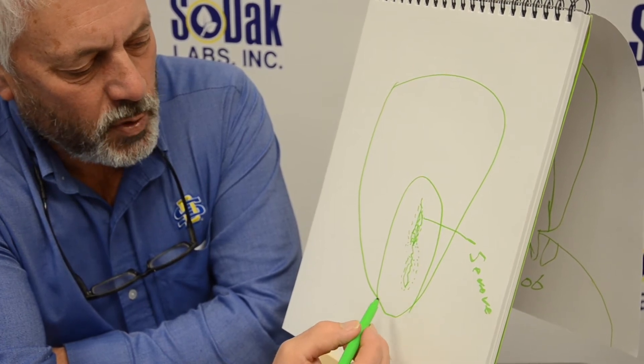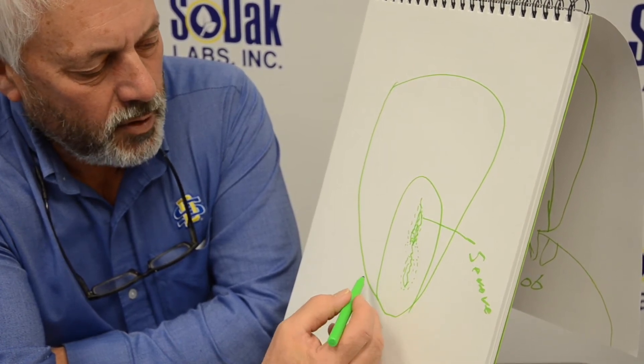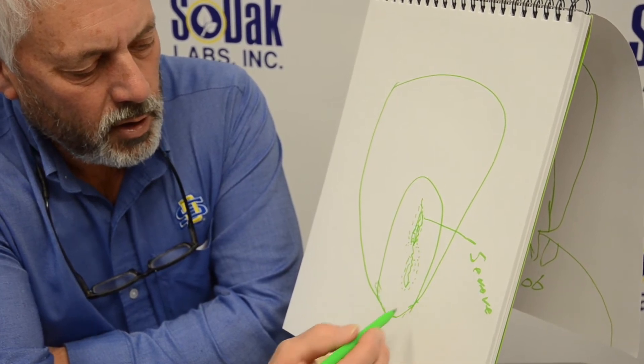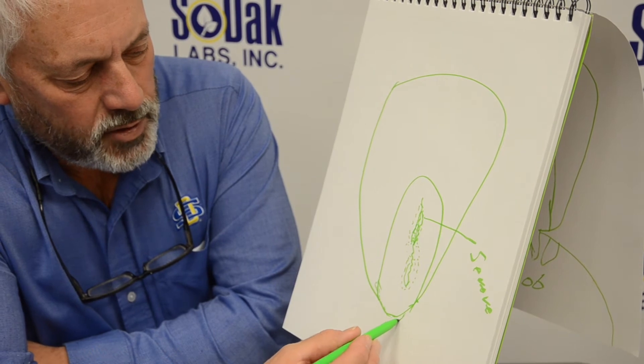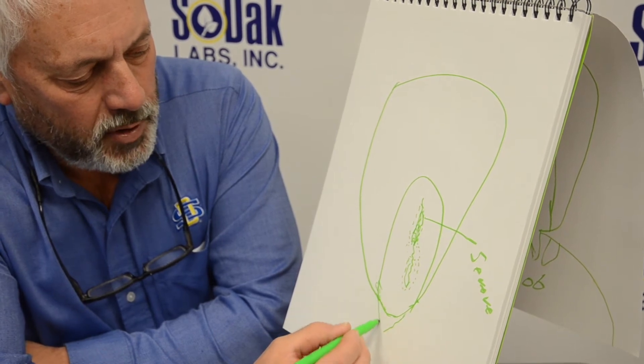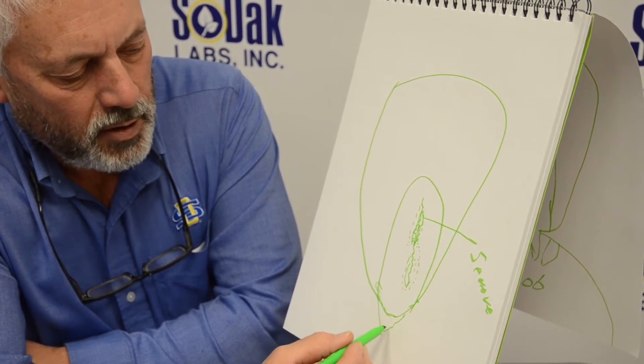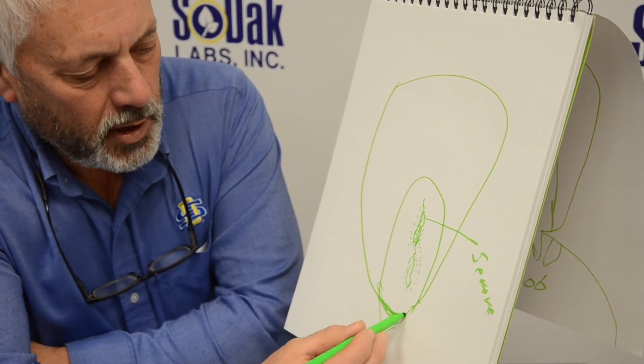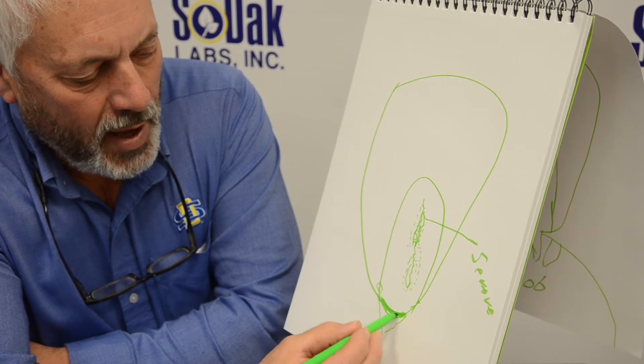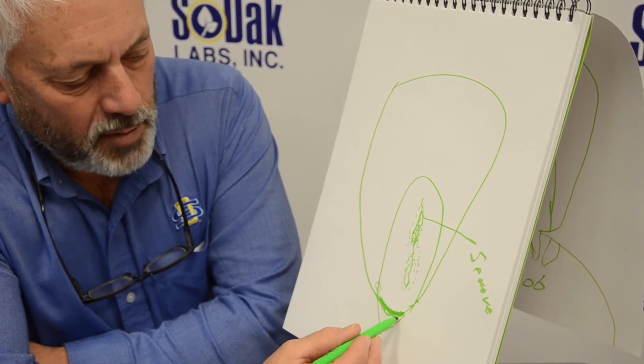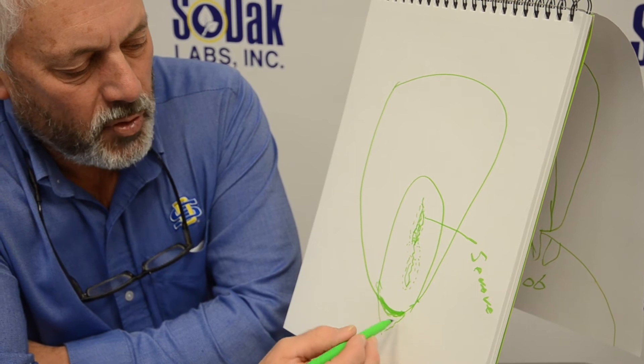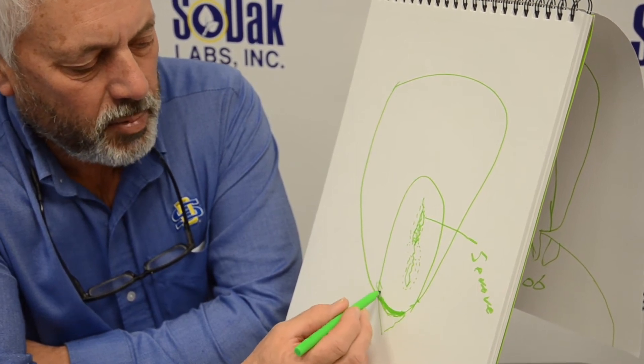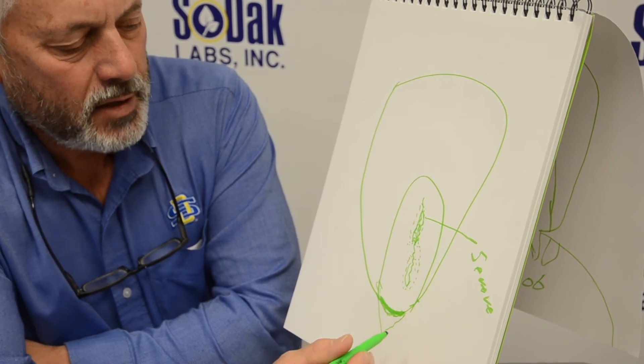Then we have two other damage ratings. We have slight when we get some tearing of the pericarp like right along here. We have to realize there's a pedestal tip that's left in the cob here. This zone right here is your black layer and it's normal for that to be black right there. On some hybrids this pedestal tip is left in the cob during shelling and you can see the black layer, but the pericarp can still be very intact.